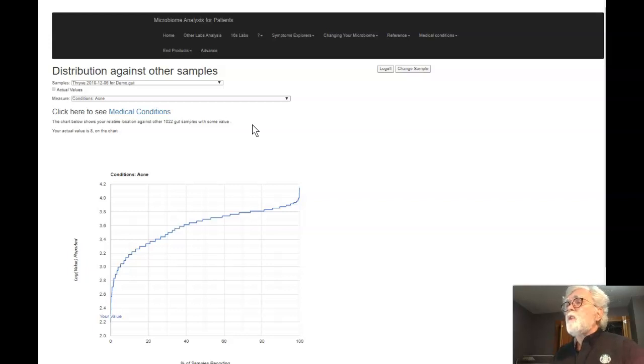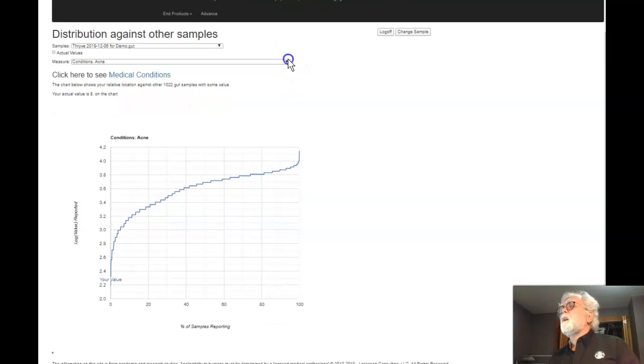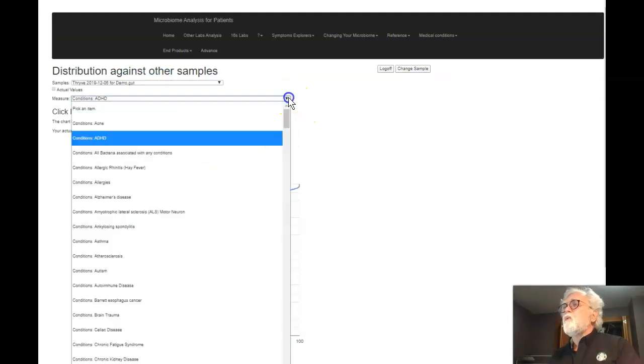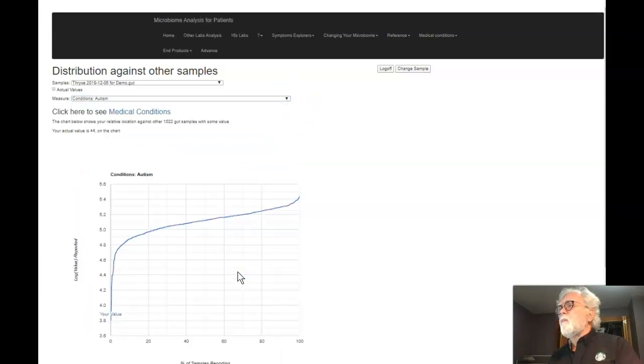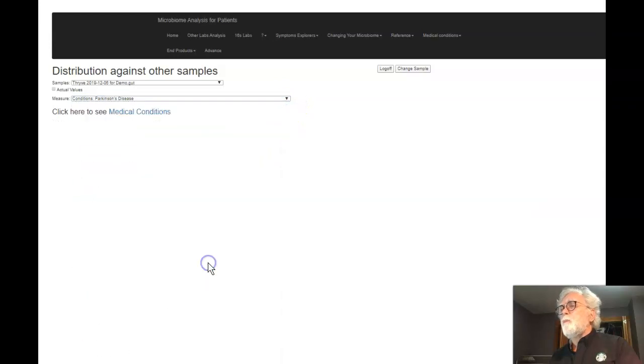What we can do actually, once we select something, is just press the down arrow. Oops. Sorry. Some pages you can get away with that. Again, see what your variety of values are. In this case, most of the values are pretty good.